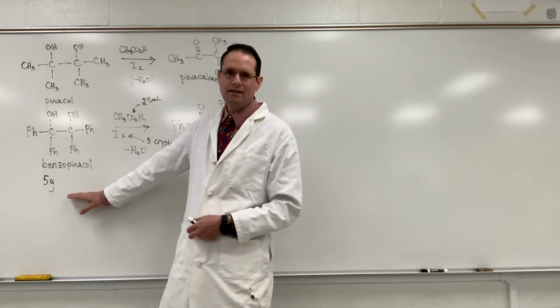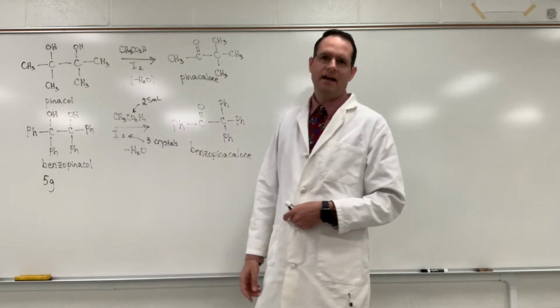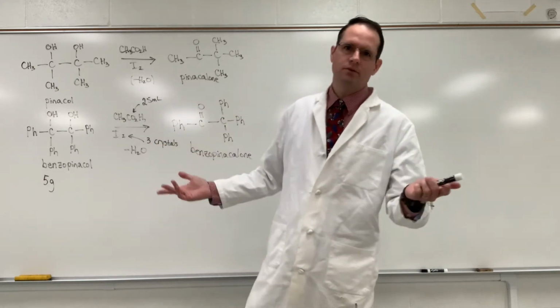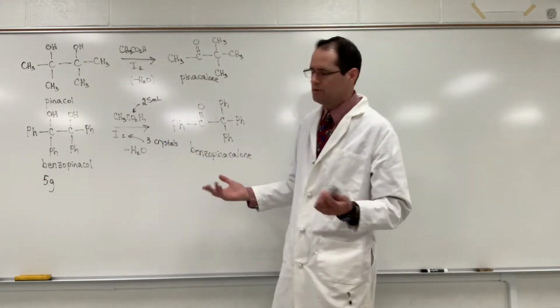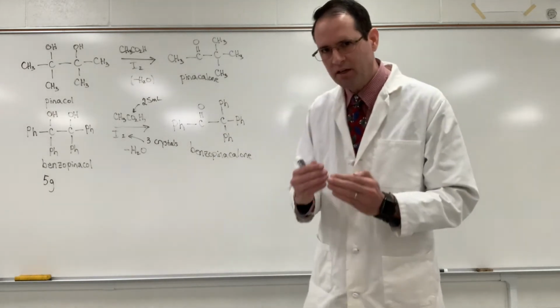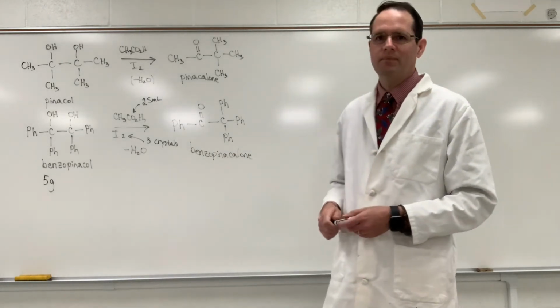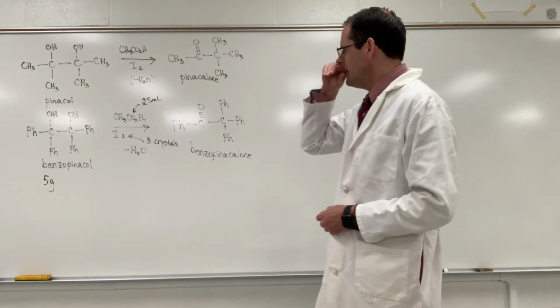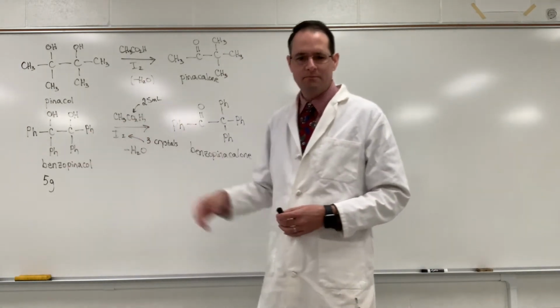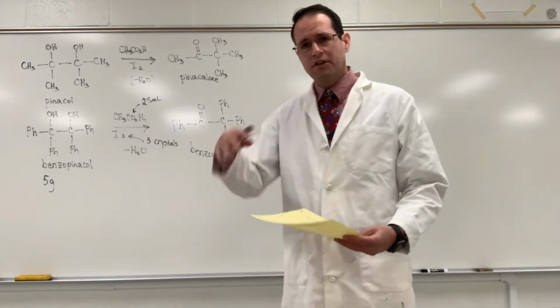So if we only had exactly 2.5 grams, there would be 0.5 times as much acetic acid, which would be 12.5. And half of 3, well, that's like 2 or something, okay? 1 or 2, you decide, okay? Like when you get the hamburger at McDonald's, you might have 1 pickle, you might have 2 pickles. They're not gonna put 1.5 pickles on a hamburger, okay? So yeah, if you have 3 grams, just do the math to figure out how many milliliters of acetic acid you'll use. Show your calculation for that.